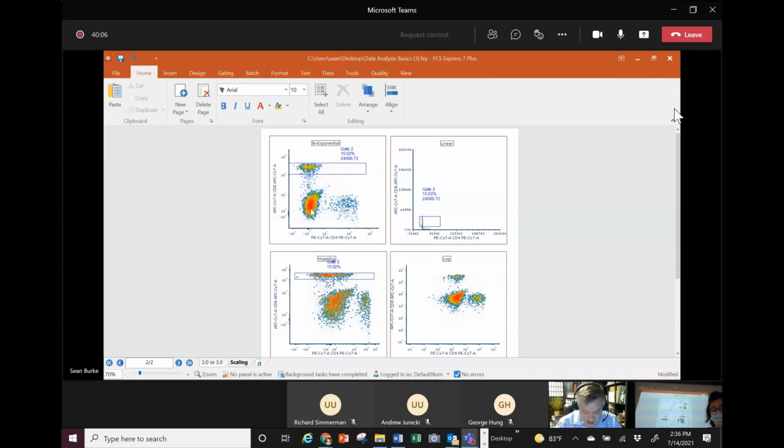But the optimized default display for this is what this chart looks like in the upper left here. Now, it's using this logarithmic scaling for most of the data. Because if we took that really wide range of data and tried to put it on a linear scale, all that stuff is squished down here in the bottom left of the chart. We can't really see what's going on. It's actually the same data. But because it's on this linear scale, everything is all smushed down and it's very difficult to see.